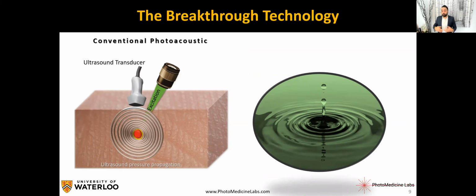So before I explain how PARS works, and the idea of this talk is to make it as less technical as possible, I'm going to give you an analogy that I always give to my students. It's not a perfect example in terms of physics, but it really will help us to understand what PARS really is. So for some strange reason, some of us, when we go camping or when we go to nature, if there's a lake or pond, we throw a stone into that lake or pond.